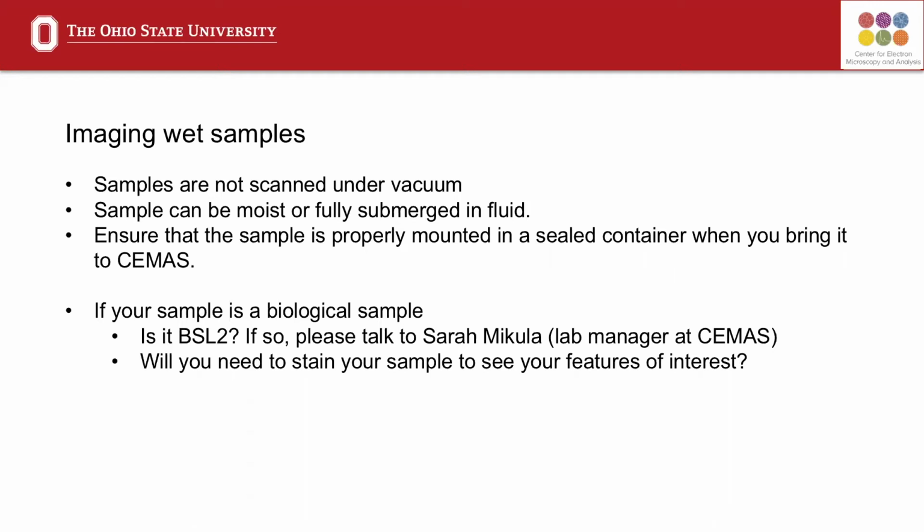If you have a biological sample, if you fix them, stain them, and embed them, that will make it really easy for when you want to come and mount it onto the CT. However, they don't necessarily have to be embedded. However, we do ask, ideally, that they be fixed. Sometimes, due to your experimental constraints, you might not want to fix your samples. In this case, contact us and we can chat about it.